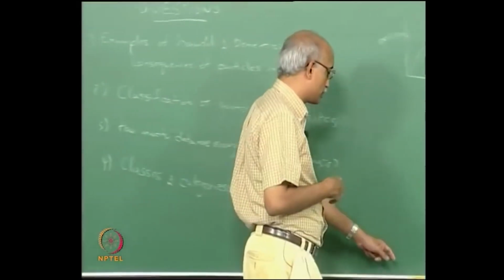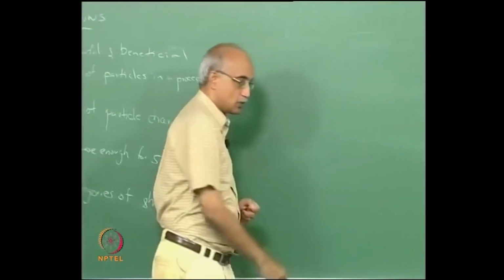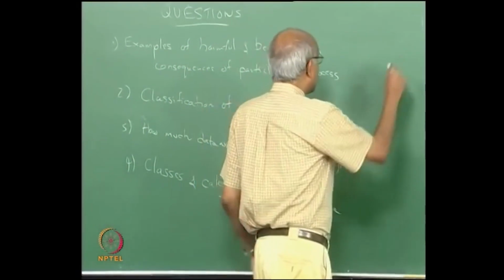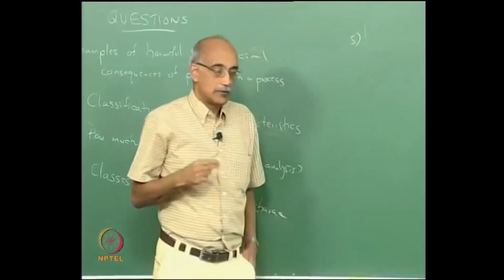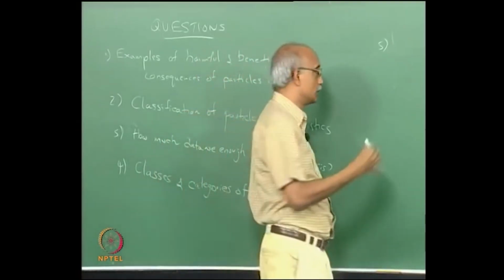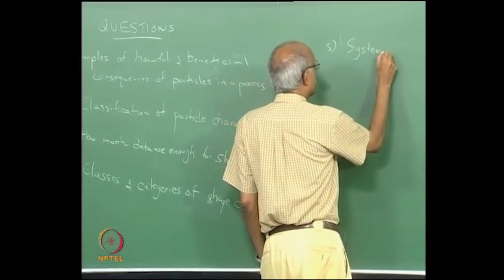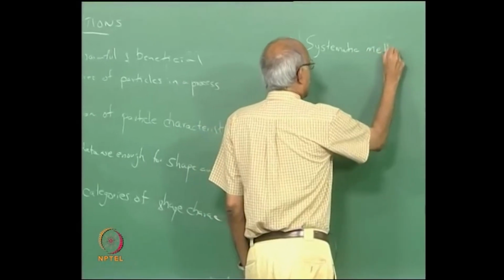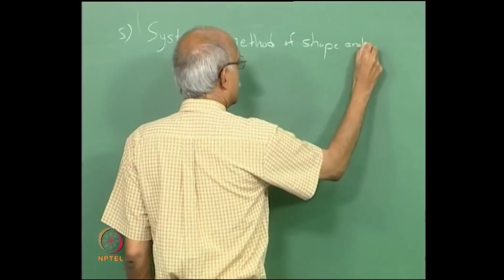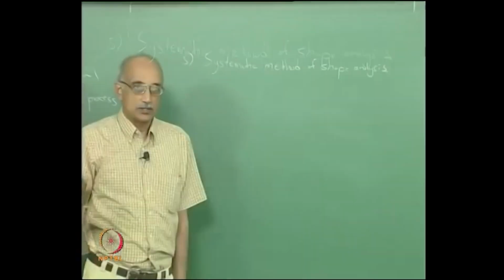So these were some of the questions, and then of course in terms of shape analysis, given that you have such a wide variety of methods available to you, it's very important to develop essentially a systematic method for doing shape analysis, which is also basically based upon pattern recognition.